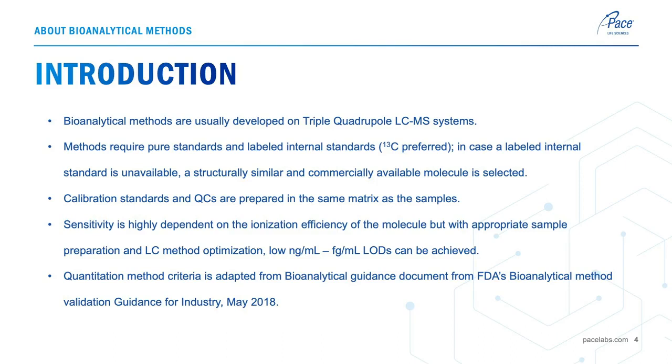Here are some additional details about bioanalytical methods. They are developed usually on triple quadrupole LC-MS instruments, where the LC can be an HPLC or a UPLC. They require reference standards for native analytes for preparation of calibration standards and QCs. Labeled internal standards, especially C13 labeled standards, are usually preferred and used for quantitation as they correct any variations produced in the native analyte responses.